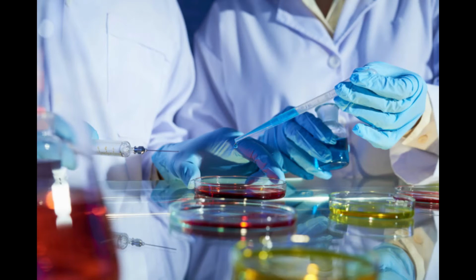The Bunsen burner will be lit. With the broth, you're going to use a loop. So if you're making notes, that's what you need to make a note of there, is that for a broth to broth transfer, you use an inoculating loop.